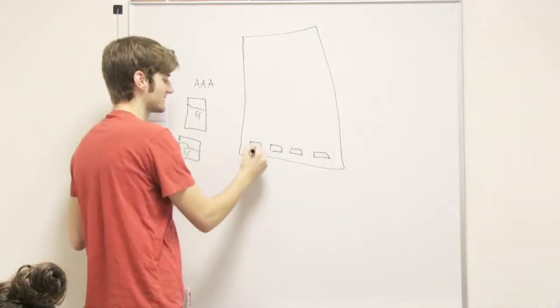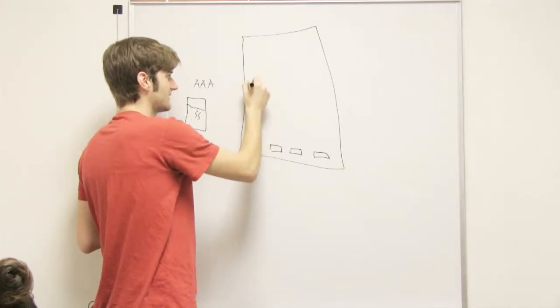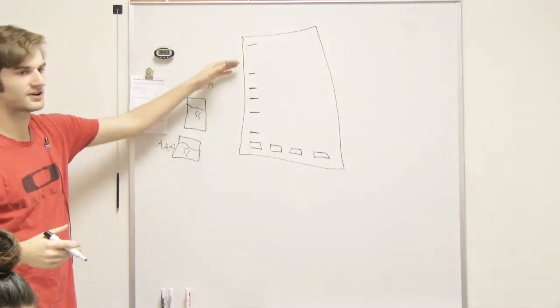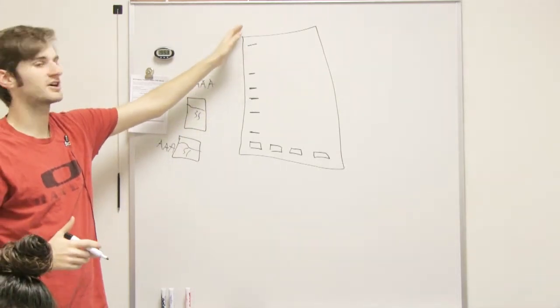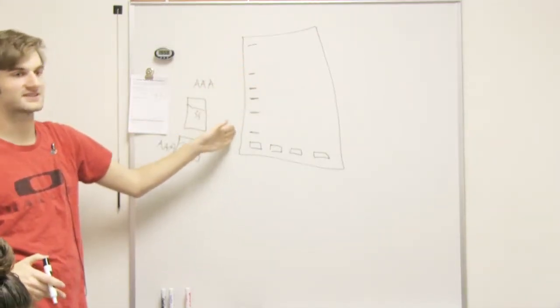So let's say this is crime scene DNA. They dye it, and they actually get these colored bands that go across. And these bands go across due to their length, because they're putting an electrical charge through it, and the DNA is actually attracted to the charge. So the DNA actually wants to travel that direction. The longer ones, though, get stuck early.